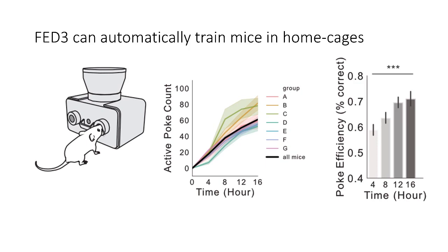While these 150 mice were not run simultaneously like a well plate, like the True Vision, you can still see that having a cheap home cage training device enables this kind of sample size.